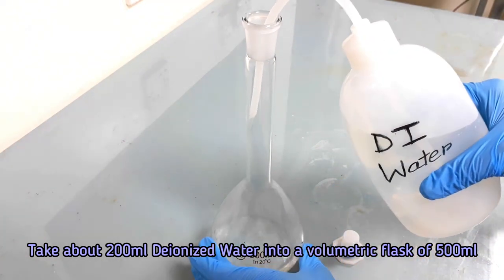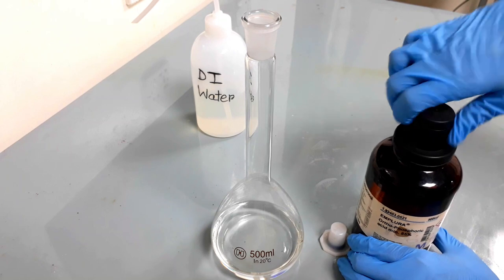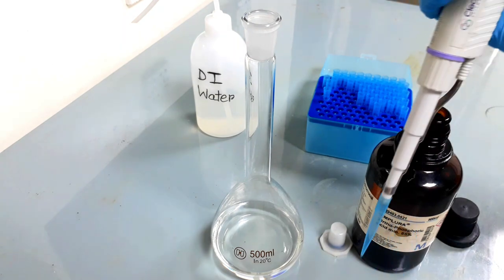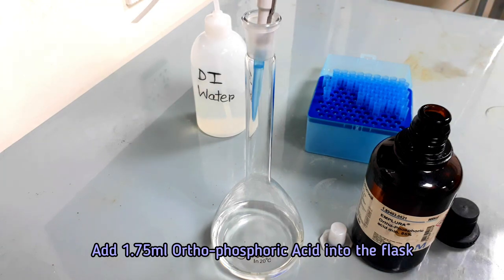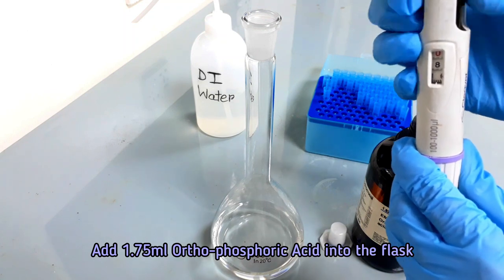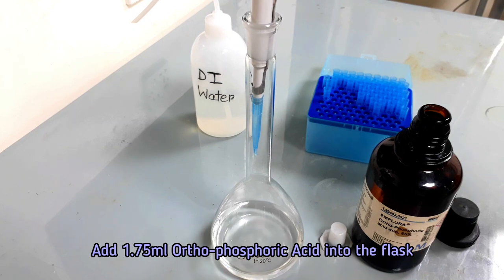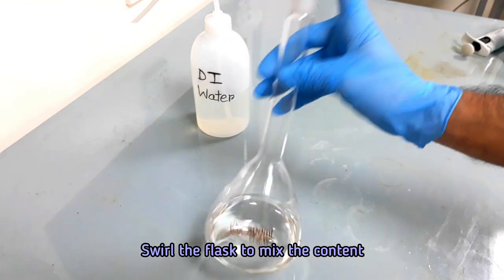Take about 200 ml deionized water into a 500 ml volumetric flask. Add 1.75 ml orthophosphoric acid into the flask. Swirl the flask to mix the content.